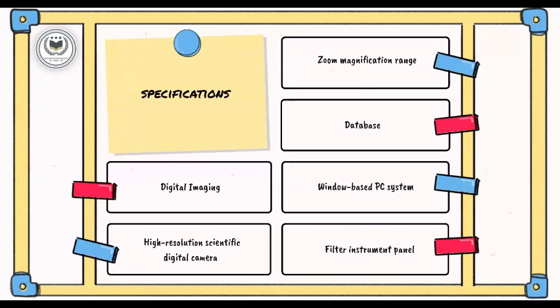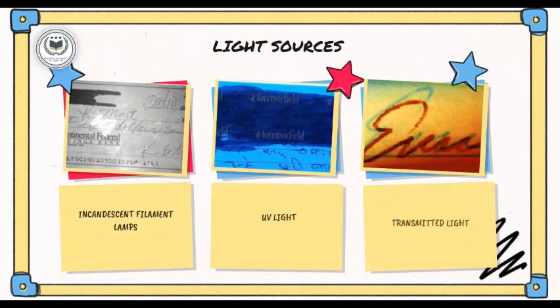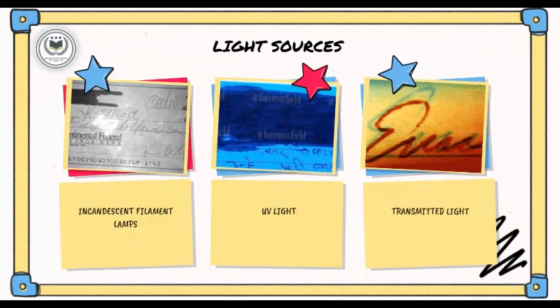With this, the filters to be used in the camera and the spot lamp while using different functions can be chosen. This can decide if the whole range of the incandescent lamps of 400 nanometers to 1000 nanometers will be measured. The first light source is incandescent filament lamps and has a range from 400 nanometers to 1000 nanometers. These lights are used in the VSC when one uses the functions of flood, transmitted, spot and side lighting.